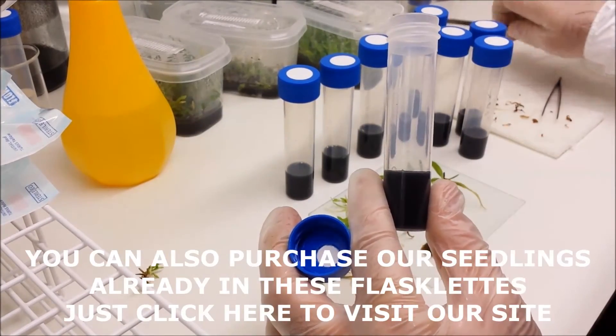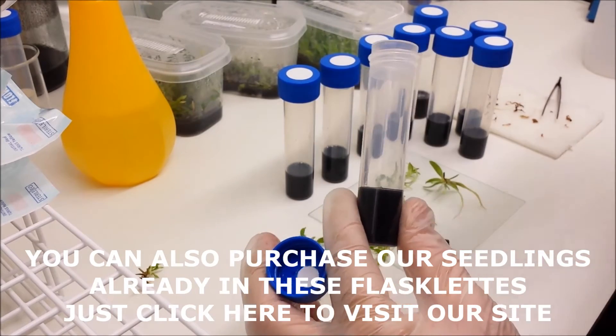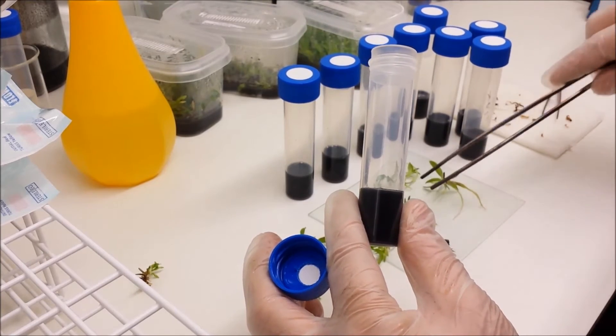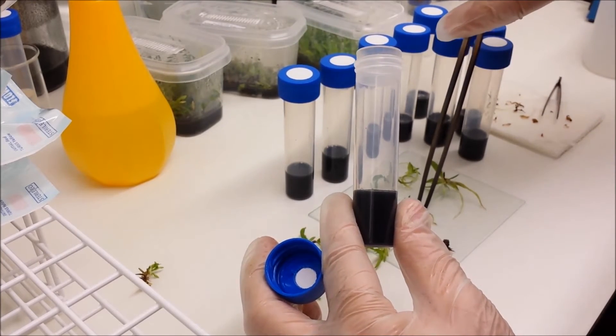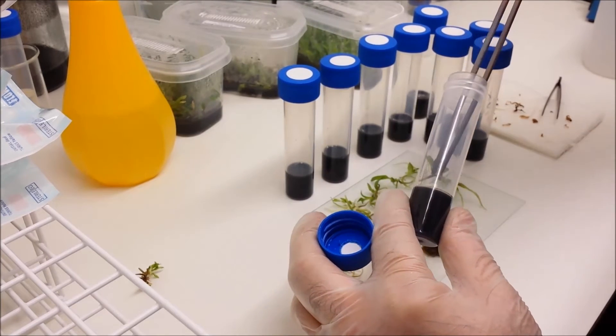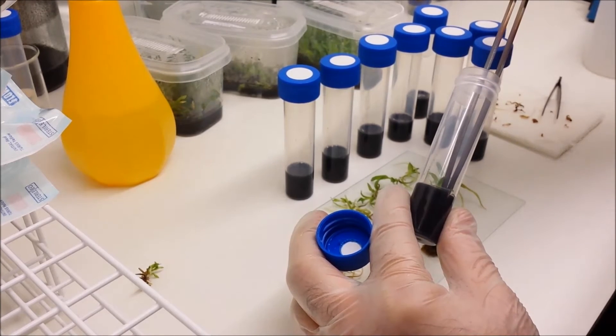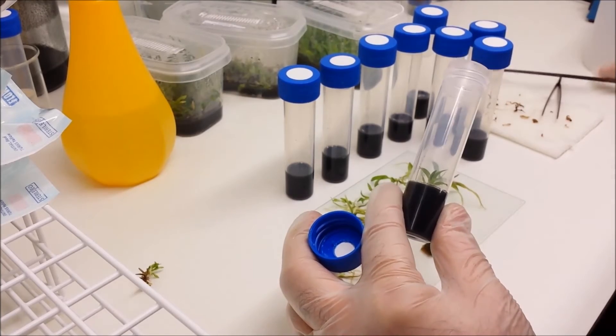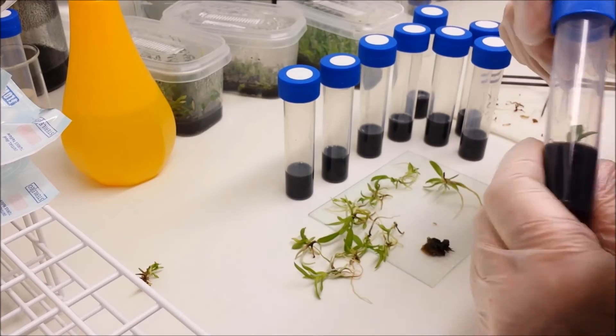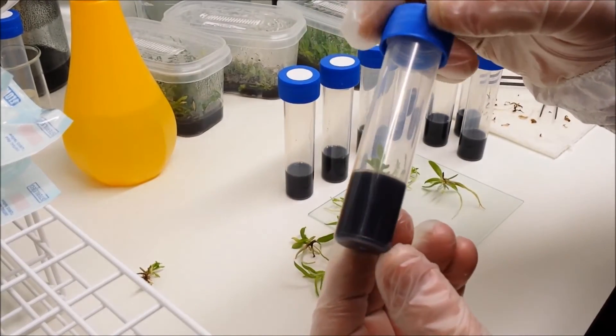So remove the lid and hold it as shown. And you'll notice we're now using the long tweezers so that we can position the plants at the bottom of the flask without a risk of dropping the tweezers in. So grasp your plant by the base, position it and gently push the roots into the medium and replace the cap as quickly as possible. There you are, that's what you're after.